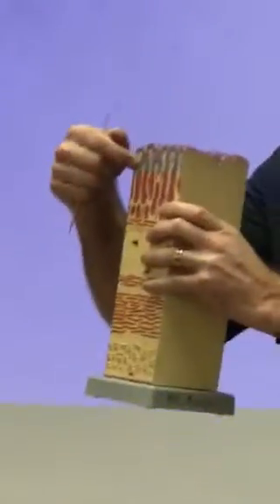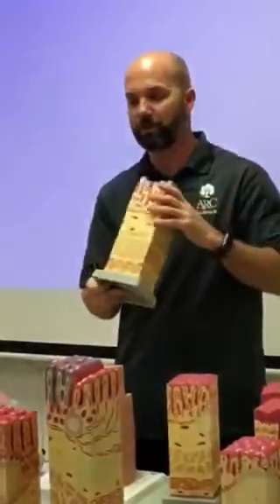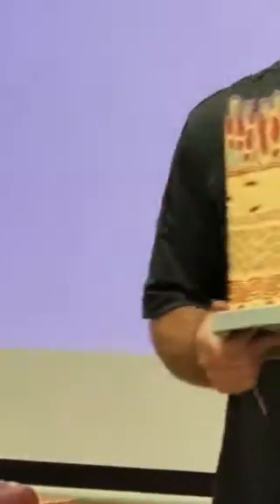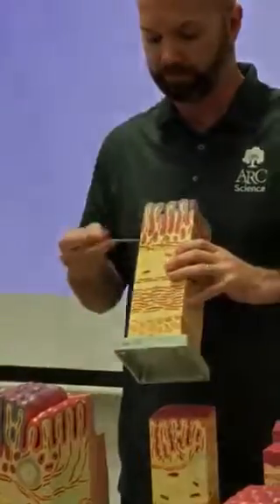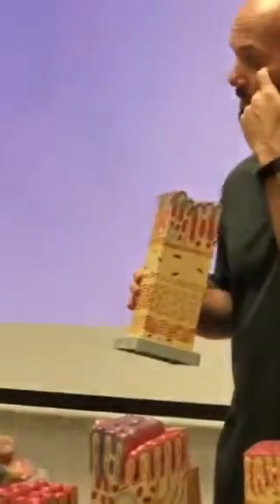Flat surface, no villi, so it's not small intestine. Stomach. The epithelium is simple columnar, so it's not esophagus. Maybe stomach, maybe colon. What could we use to differentiate? 3 layers. 1, 2, 3. There's your 3 layers. It's got to be stomach. Which means all of these mucosal glands are called gastric glands.